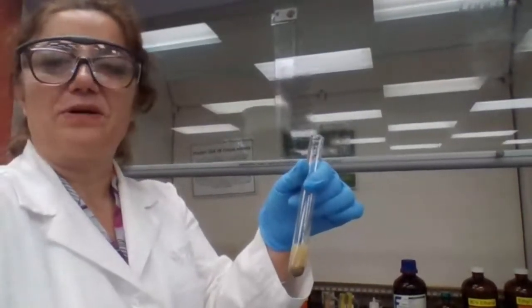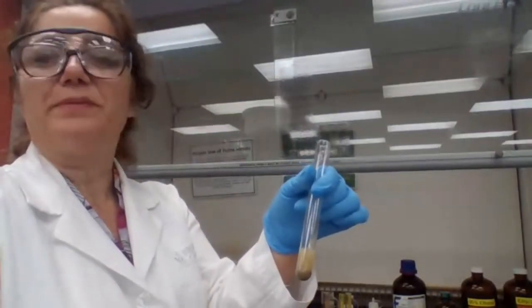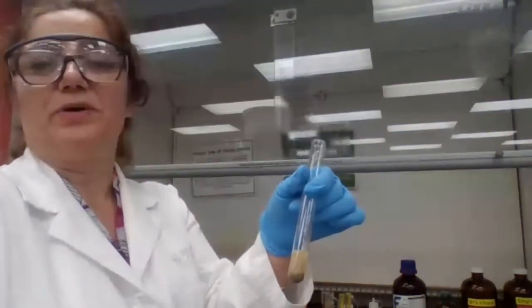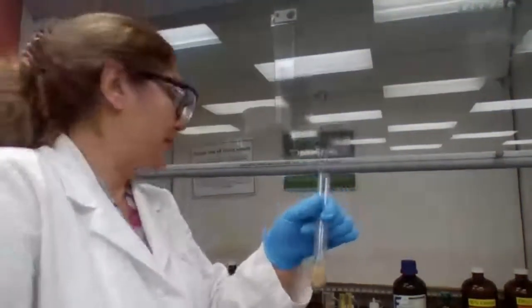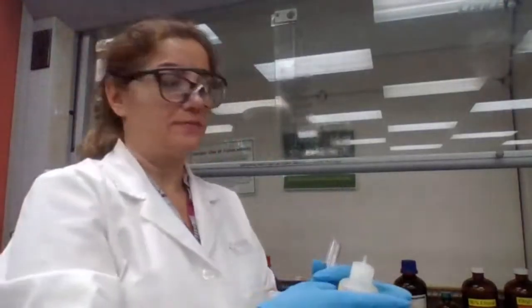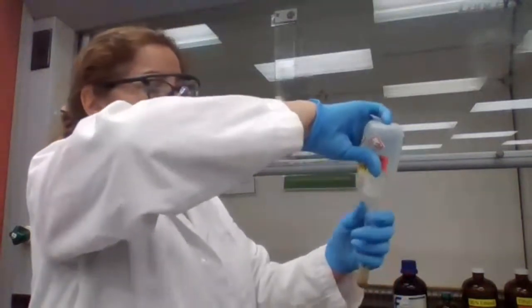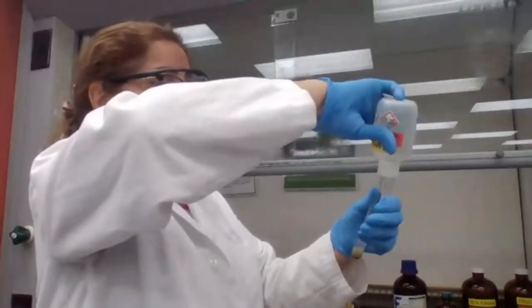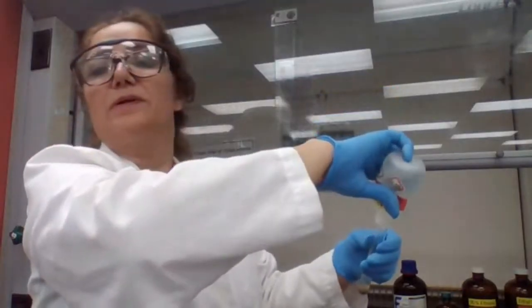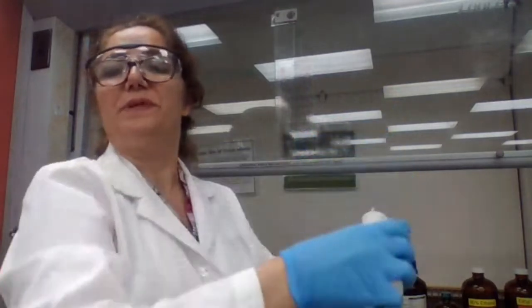Do you have your steps in your lab notebook by any chance? It's probably easier to find it there because you wrote it. Add ammonium hydroxide. Okay, add ammonium hydroxide. How much ammonium hydroxide should I add? Dropwise until the precipitate dissolves.